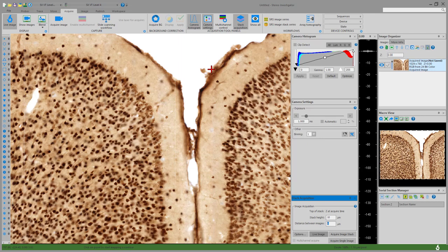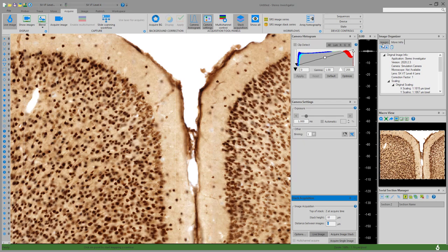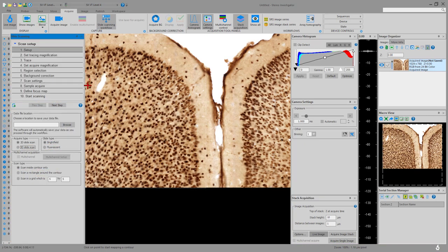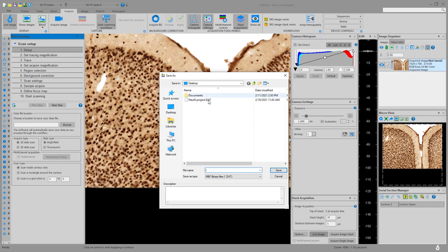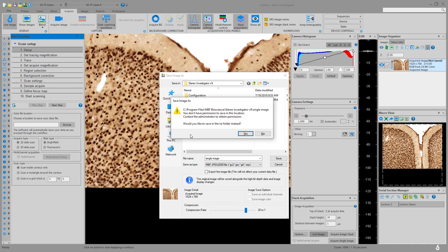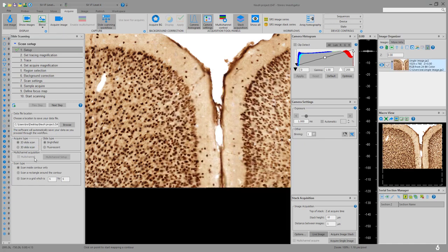Let's jump into the slide scanning workflow. This walks you through a relatively complex process but simplifies it with a workflow. The first step is setting things up — what kind of scan do you want to do. We're going to set up a 2D bright field scan within our contour. You can also acquire a fluorescent scan and set up multi-channel acquire or 3D. For our purposes today, we'll keep it simple — bright field, 2D — and proceed to start tracing. We'll go to low magnification and trace, utilizing the auto-move area to click and indicate where we want to acquire.